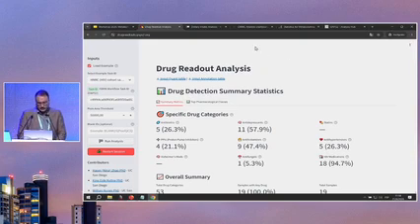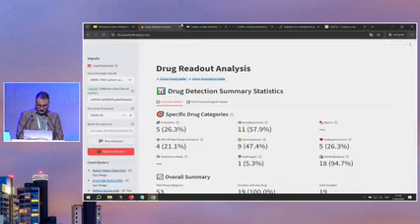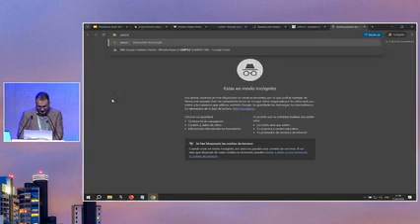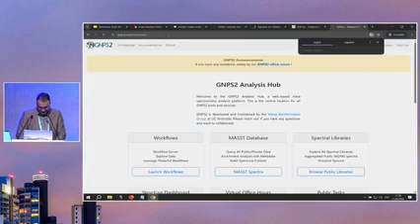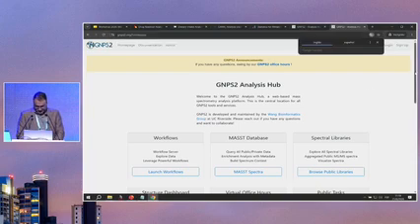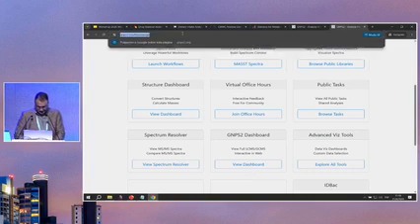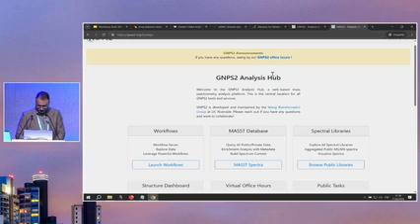Okay. Yeah, let me try to open it. Okay, yeah.